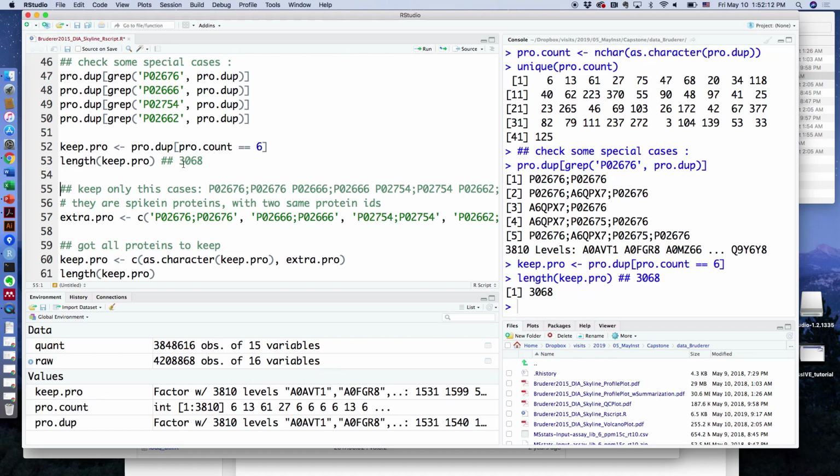I have a question. Yes. So, you analyze the same set of peptides, and you keep the ID, and if the peptides are shared between proteins, you leave them as independent? Right. So I just want to use them. So you go one by one. At this moment, yes.